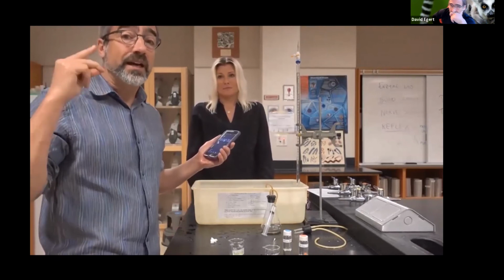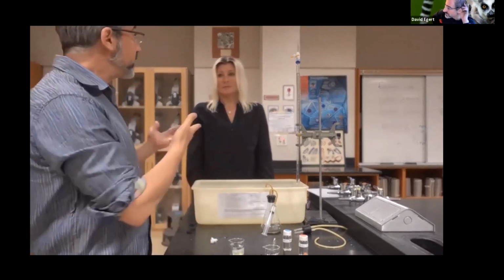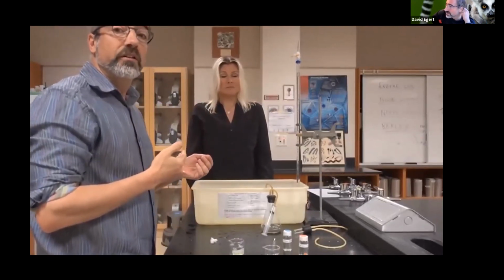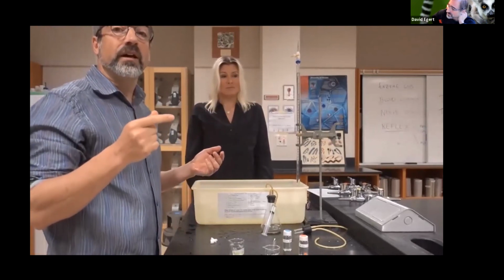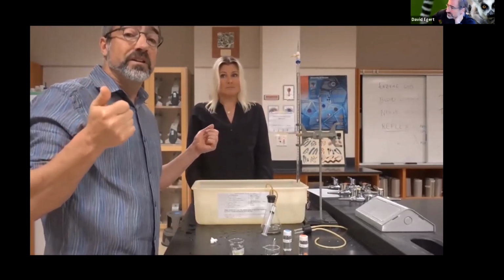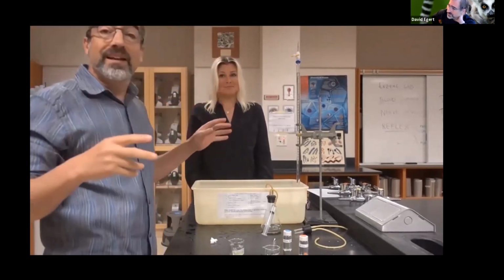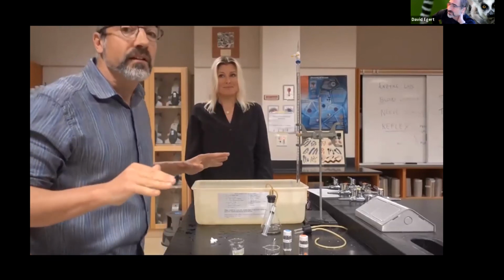It's just every 5 seconds there is a time mark. There's going to be the reader who is reading the volume of water at the moment they hear the yell time, which can be a little flustery because there might be bubbles coming up, so you want somebody on your team who's got nerves of steel.